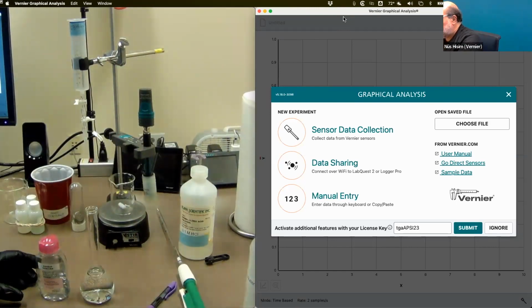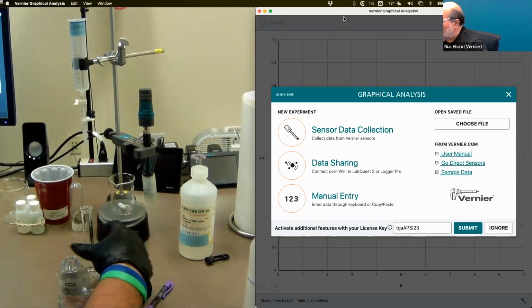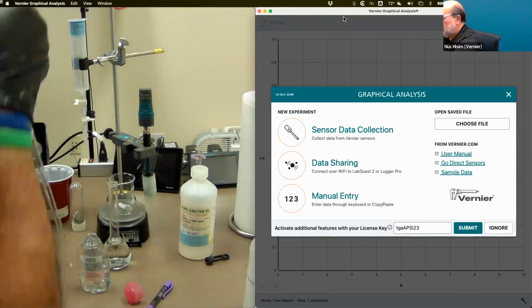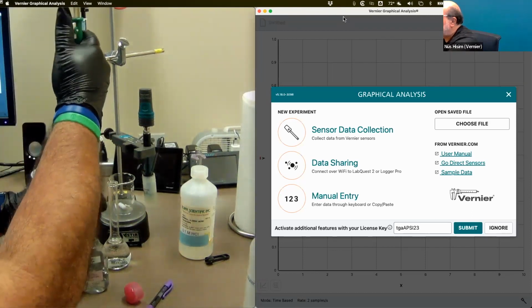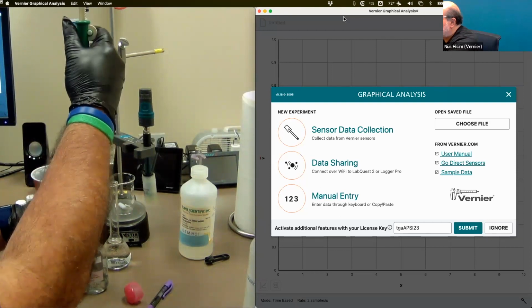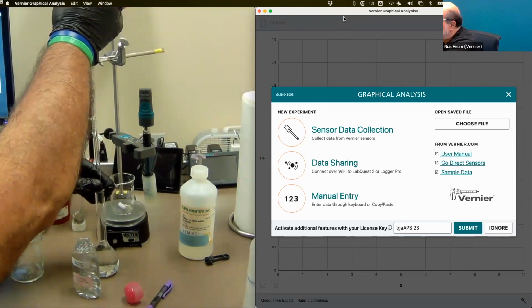So what we're going to do is take 5 milliliters of the concentrated contaminated crime scene sample, and dilute that. Let's get 5 milliliters. Your call how you do this. I wrote it with pipettes, thinking that would be kind of neat to do it that way. Graduated cylinders are certainly doable. Okay.